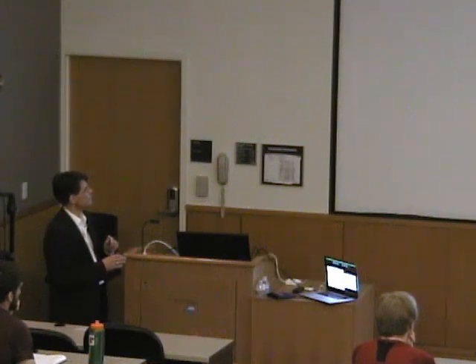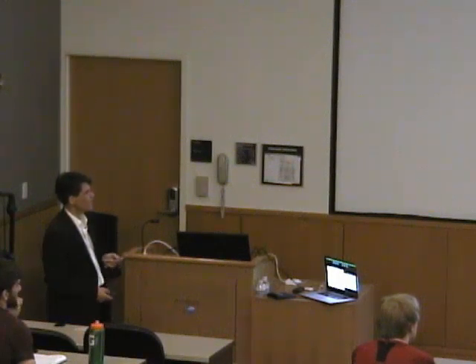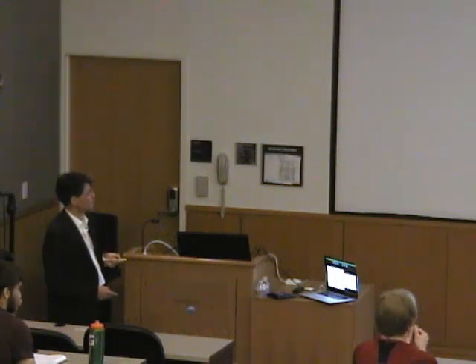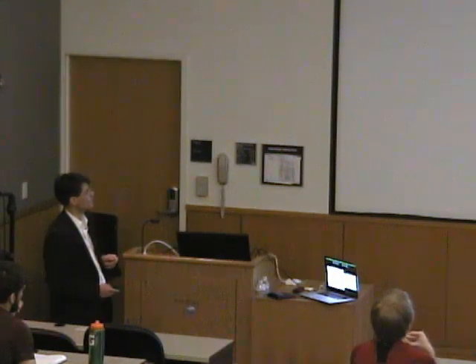Now, without introducing any fitting parameter, Phil Stevens had published these MCD data, and these are the experimental data, and these dotted lines are the predictions of the theory without any adjustment whatsoever. And so you see that it is correct. Essentially you can predict, given that master equation and the zero field splitting, the MCD correctly. So there's every reason to believe that the theory is correct, and it has been used now for 15 or 20, almost 20 years, and it has served exceptionally well.